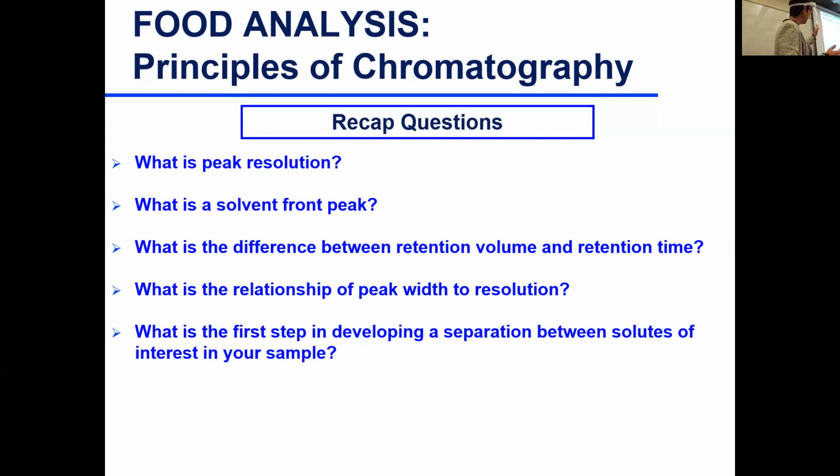And then the retention volume is the associated volume of the mobile phase that it took for that compound to reach. And usually you calculate that based on the flow rate. So if it's 1 milliliter per minute, and the retention time is 10 minutes, then it took 10 milliliters of the mobile phase to actually elute that compound.